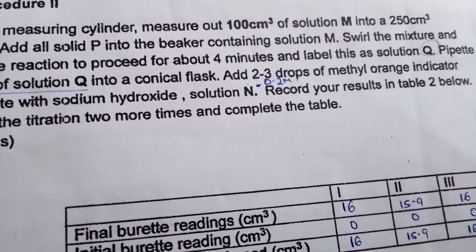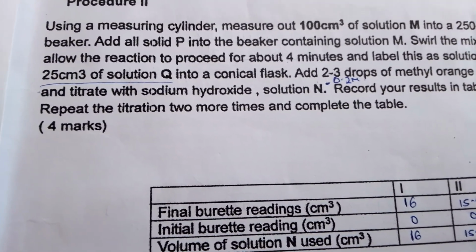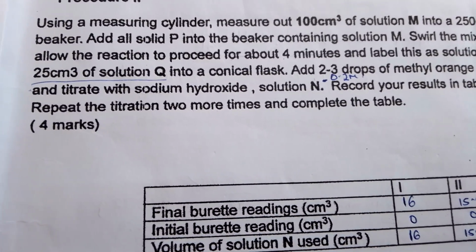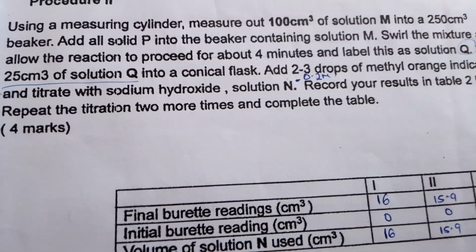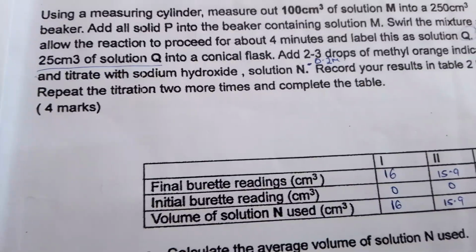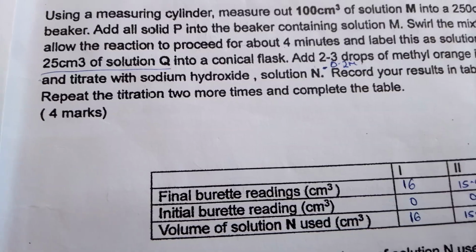Add 2 to 3 drops of methyl orange and titrate with the sodium hydroxide solution N. Record the results in table 2 below and repeat the titration 2 more times and complete the table.